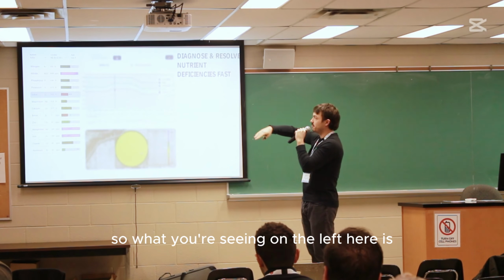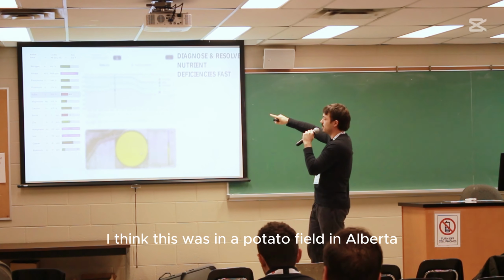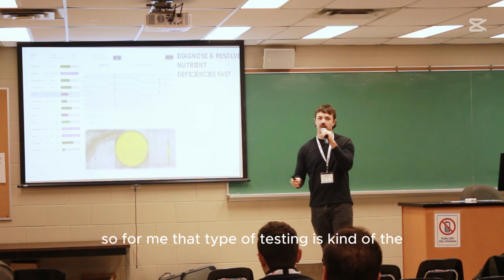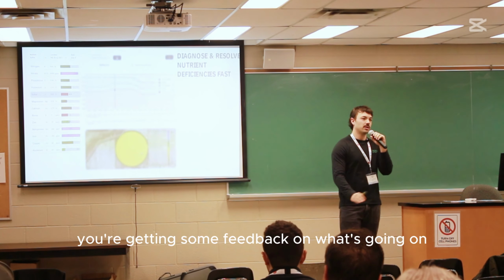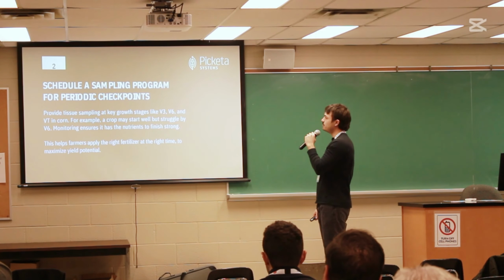What you're seeing on the left here is a single one-off sample. I think this was in a potato field in Alberta, but on the left there is what you see for that single one-off report. So for me, that type of testing is the first rung on the ladder. At least you're getting some feedback on what's going on, and maybe it'll shed some light.